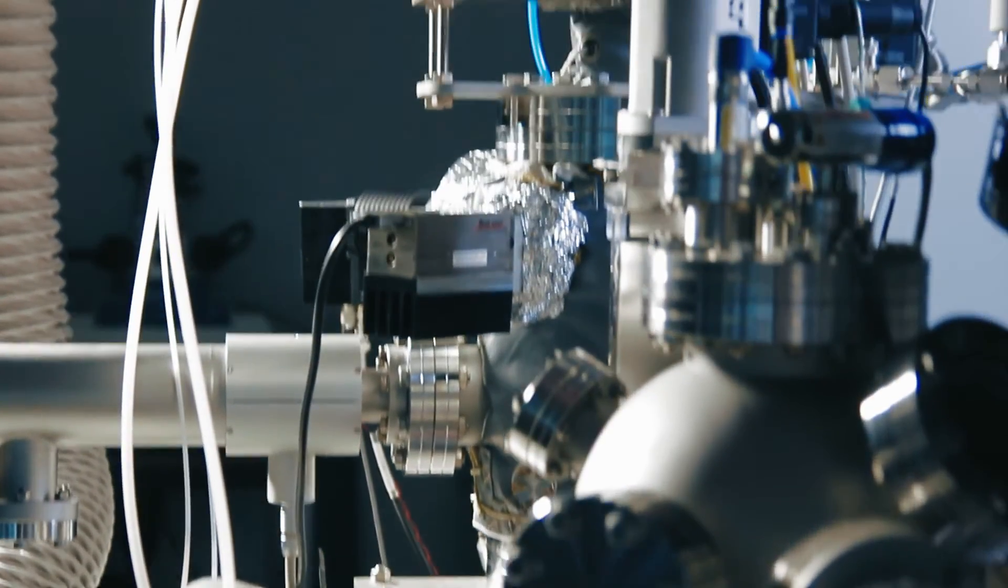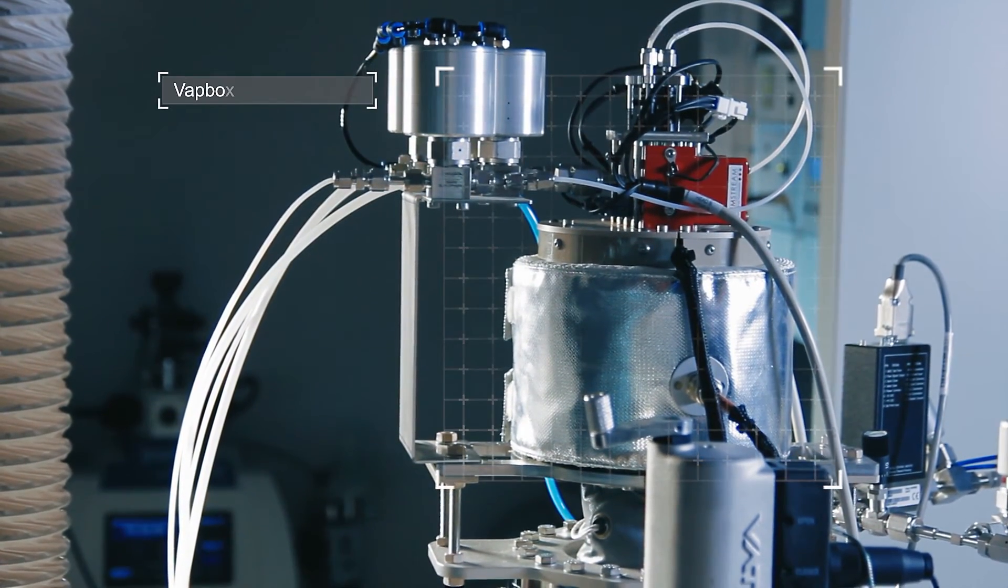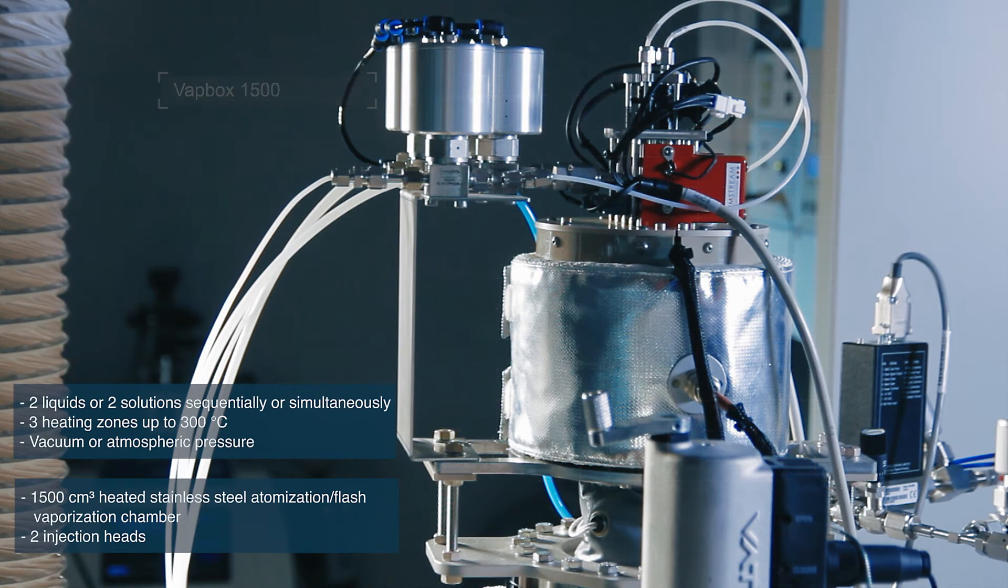The VAP Box 1500 is a versatile high-performance vaporizer, which can vaporize two liquids or two solutions sequentially or simultaneously at temperatures up to 300 degrees centigrade while under vacuum.